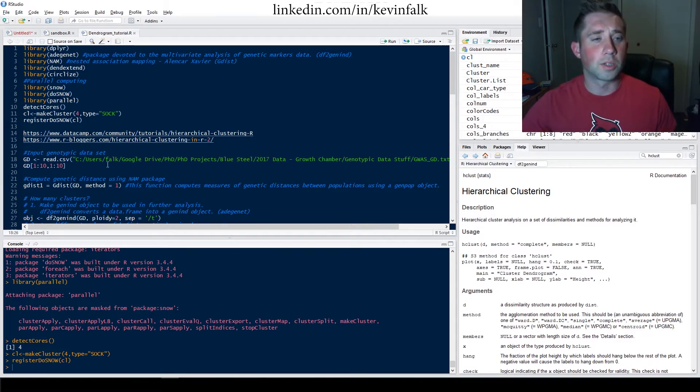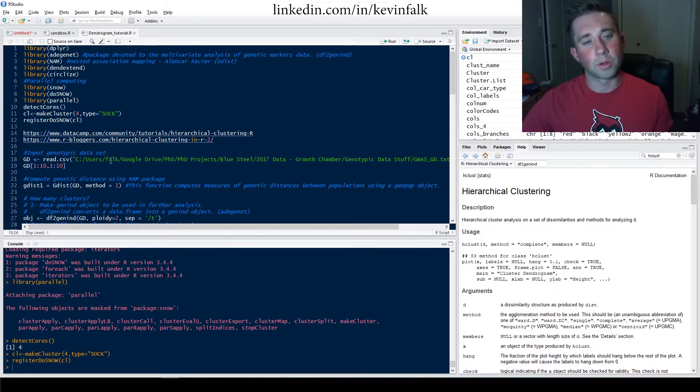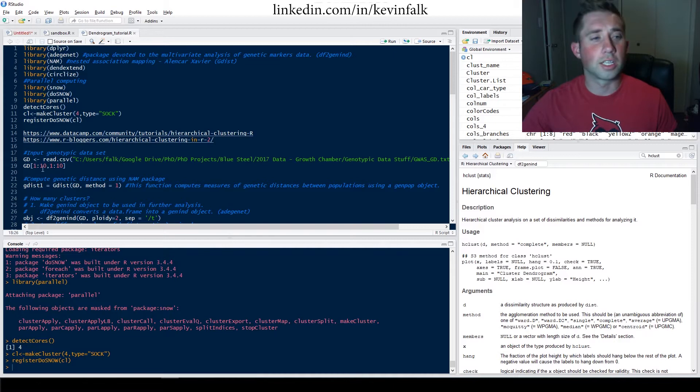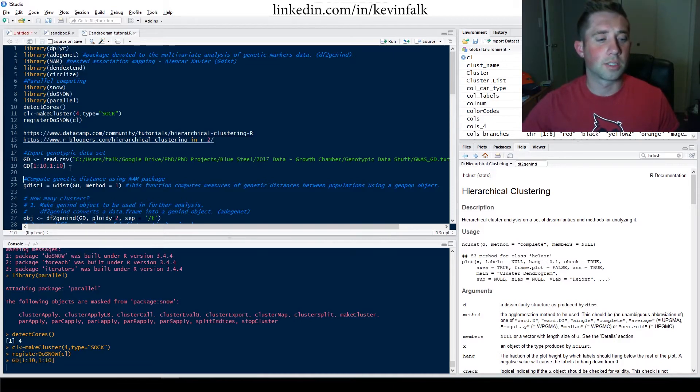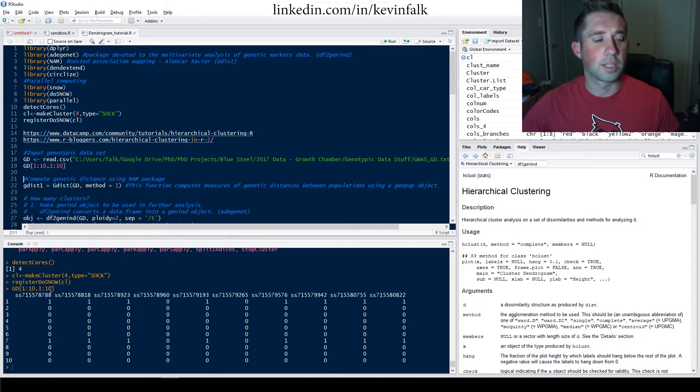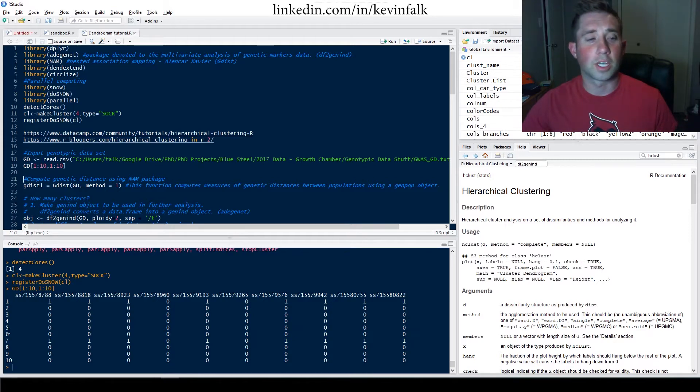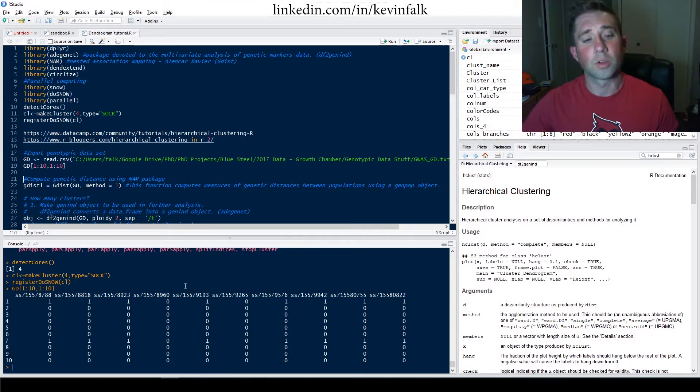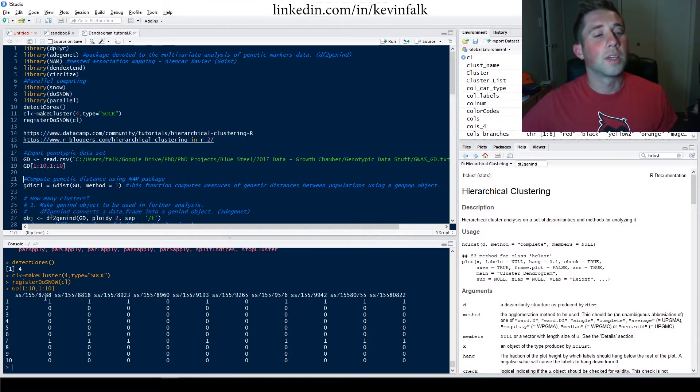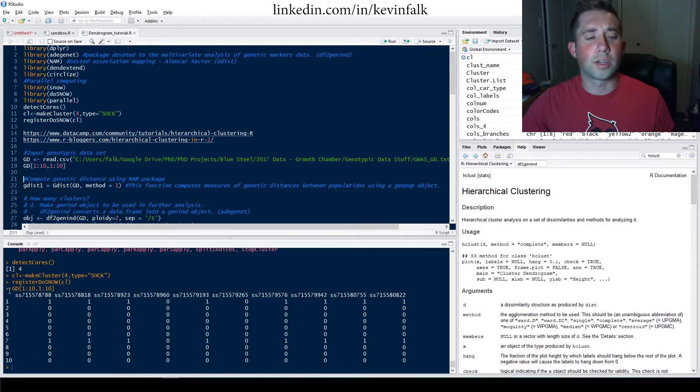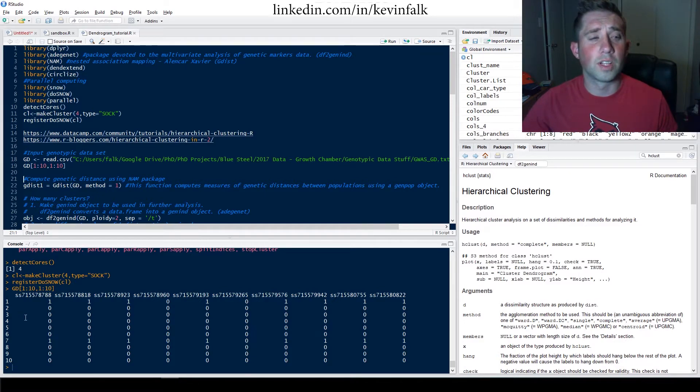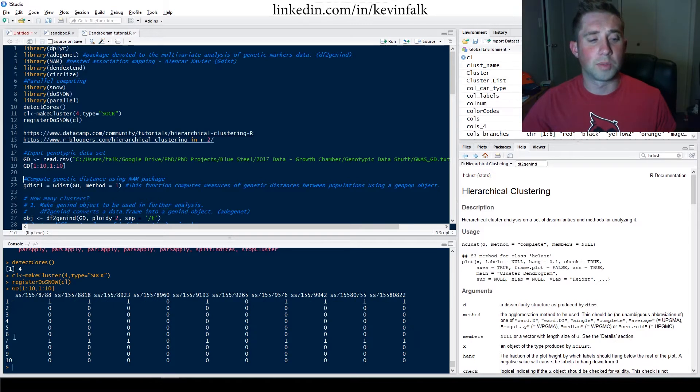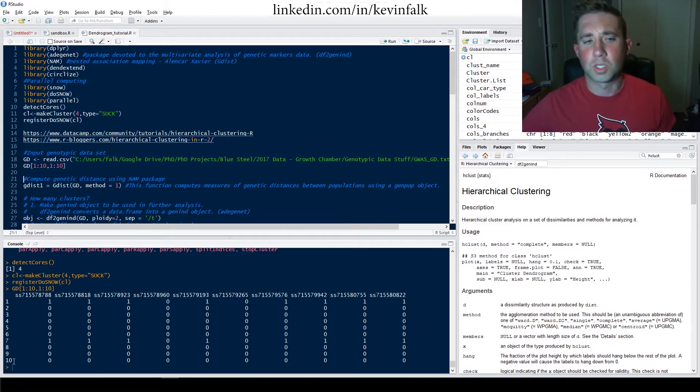Two of the websites or tutorials that I used to help build my knowledge, these aren't exactly identical to what we'll be doing today, but they're listed here. So feel free to look at them and if you get stumped, there's a lot of help online as well. So here you can upload or input your genotypic data. I called mine GD as in genetic distance. And it looks just like this in which down the left-hand side we have genotype. So those are the rows and the columns are the SNPs. And I don't have a label. I removed the label in a previous step. So that's just type one, genotype two, all the way down to about 300 genotypes, which I had in my study.